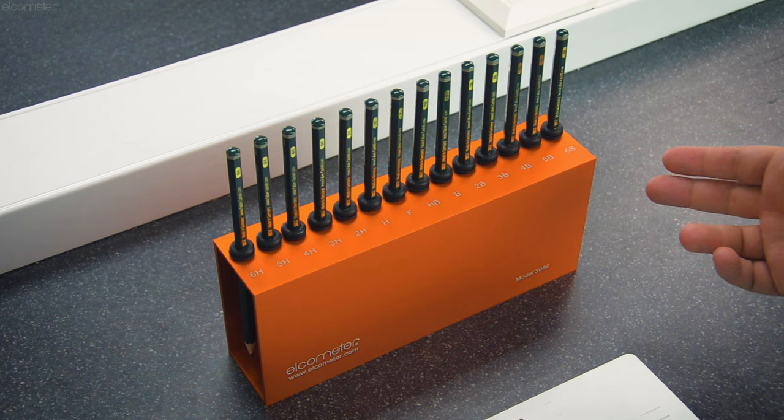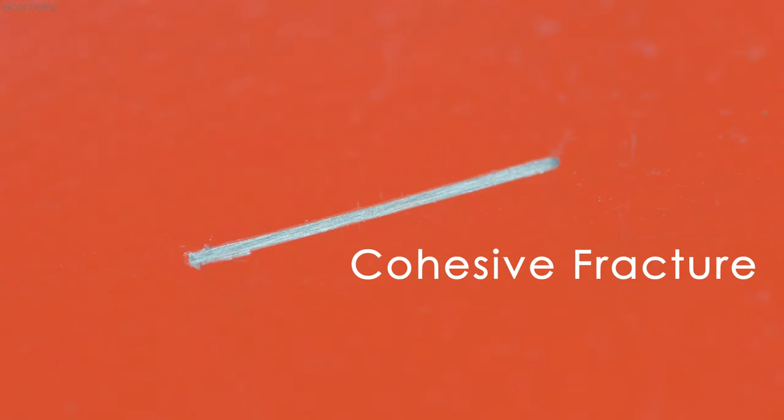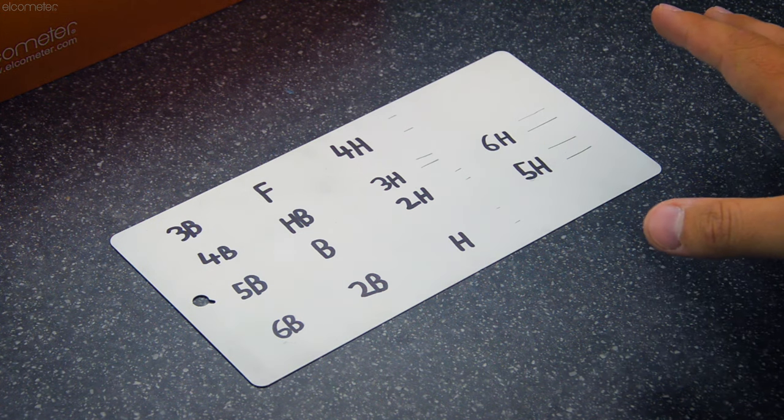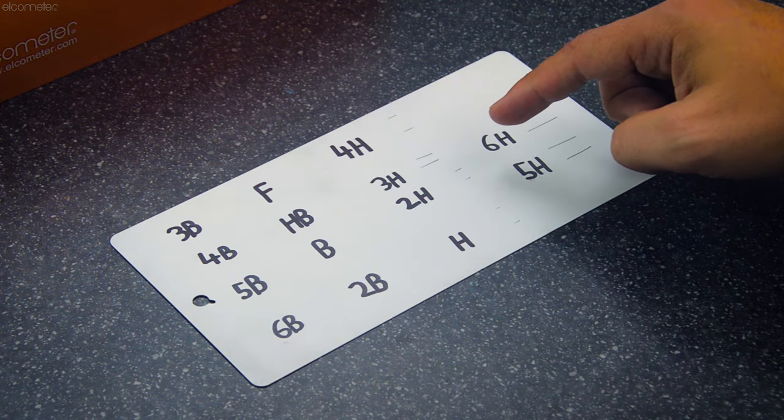Alternatively, other standards such as ISO 15184 don't specify which pencil you need to start testing with, although many in the industry tend to start with the softest pencil and continue up the scale until you find the pencil that leaves a mark of over three millimeters long out of the six millimeter test push. That mark can be defined as either one or a combination of two defects: a permanent indentation or scratch that does not cut through the coating, known as plastic deformation, or a visible tear or rupture in the surface of the film, known as a cohesive fracture. Starting at the softest pencil and working up, the softest pencil to leave a mark of over three millimeters is 2H, with the majority being a cohesive fracture and some plastic deformation on the edges.